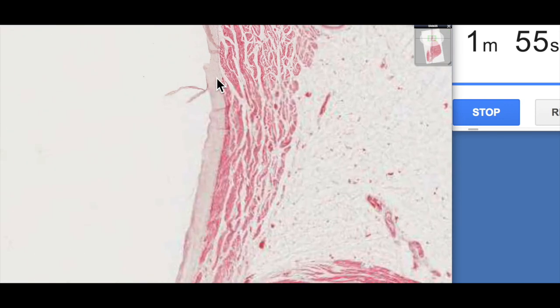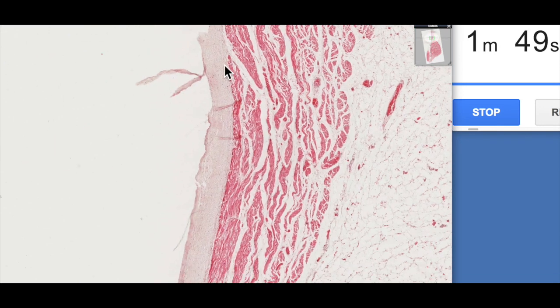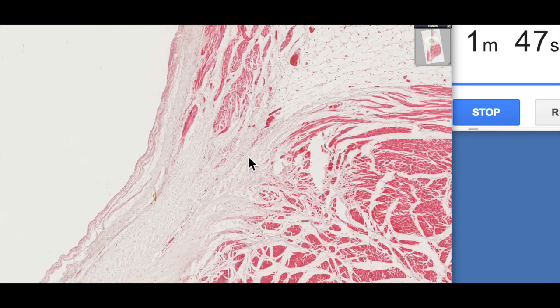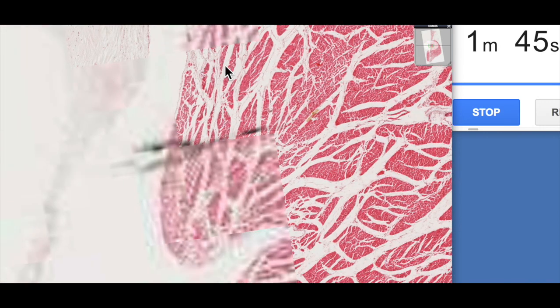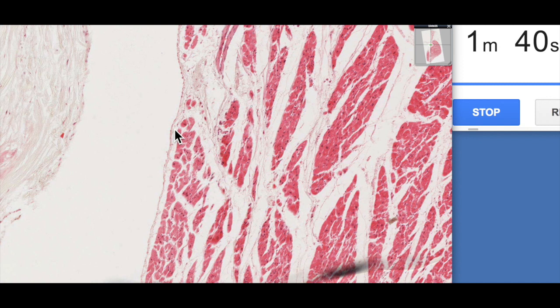Very thick endocardial tissue here. You can see all this connective tissue. There's a simple squamous lining here. If we go down to, we can probably just squeeze down here, go down to the ventricle, you can see in comparison there's a very thin layer of endocardium and then most of this layer is made up of this myocardium.